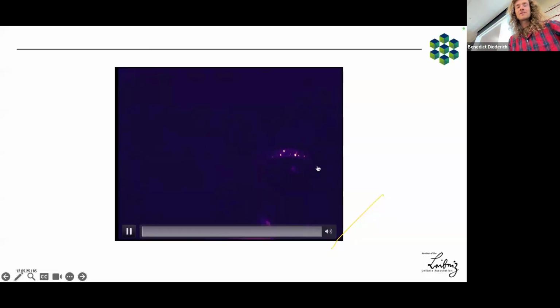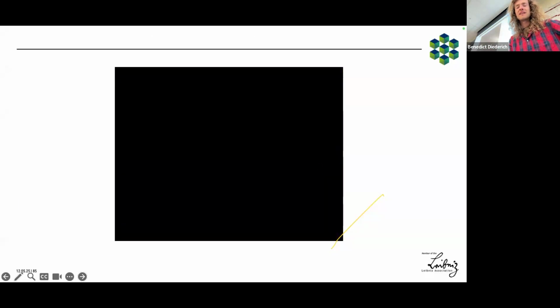Cool. Is there more? It just looks funky. So these are some Nematostella. Yeah.